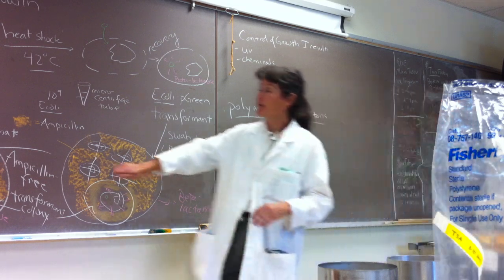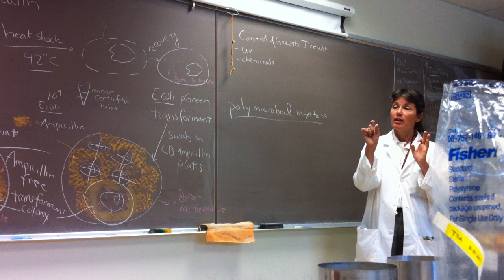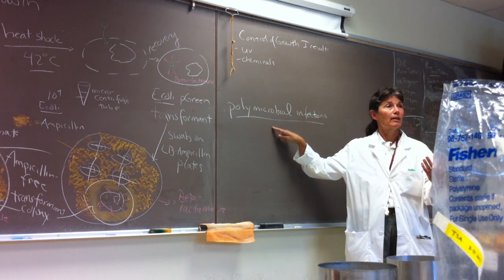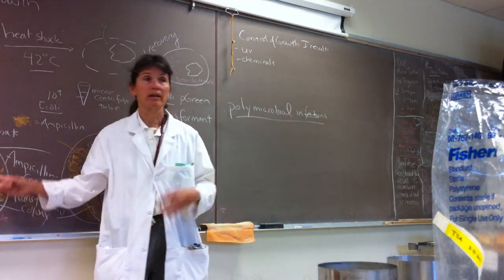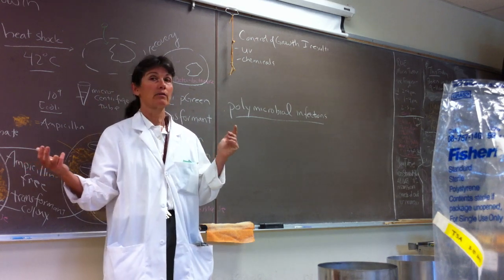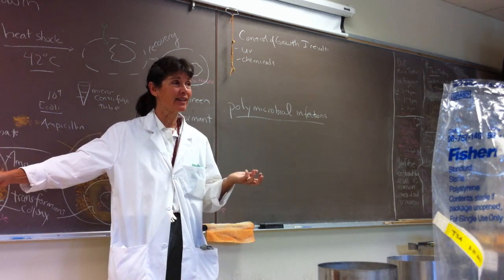Just imagine, you guys, this is your patient with a polymicrobial infection going on. The point here is that if there's a single bacterium in there that's pumping out an enzyme that can destroy an antibiotic, that single microbe can produce an antibiotic-free area, so the other microbes that lack antibiotic resistance genes might be able to grow there if you put that patient, say, on ampicillin. Does that make sense to you guys?